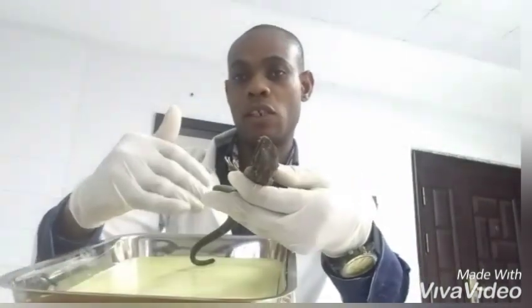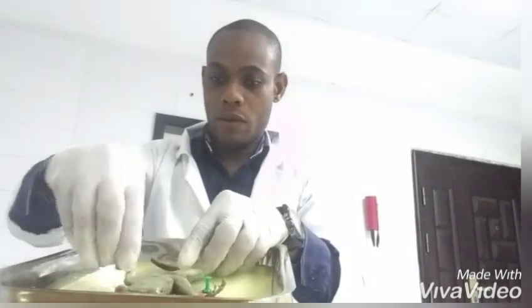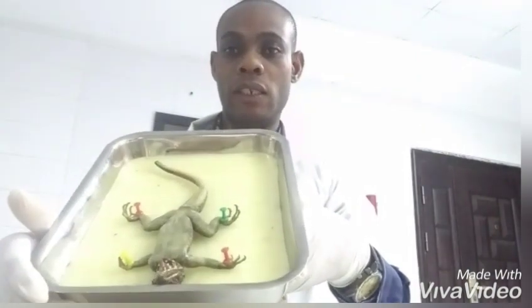I'm going to pin this lizard to the dissecting board and begin the dissection. The lizard is now pinned to the board, as you can see — it is very stable and ready for dissection.